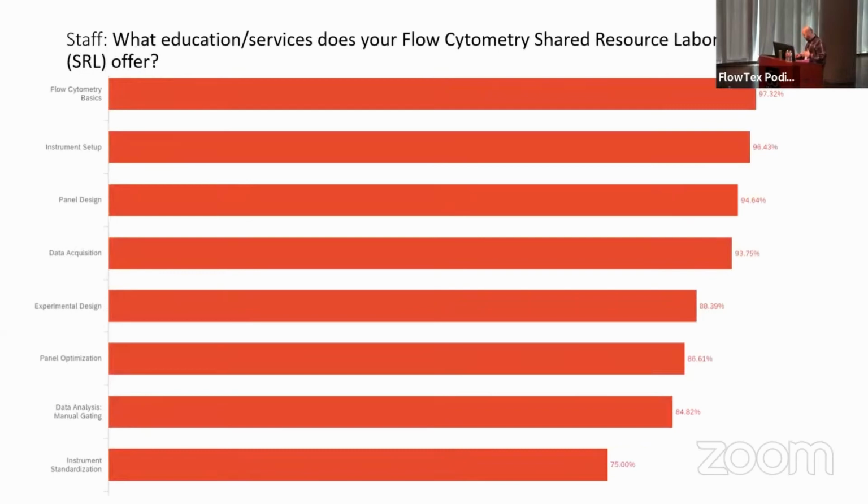So we asked people, what do you do in your lab? What kind of services do you provide? Everybody does instrument setup, right? That's really basic. A basic course about theory of flow cytometry, panel design, data acquisition. All those things are very routine.